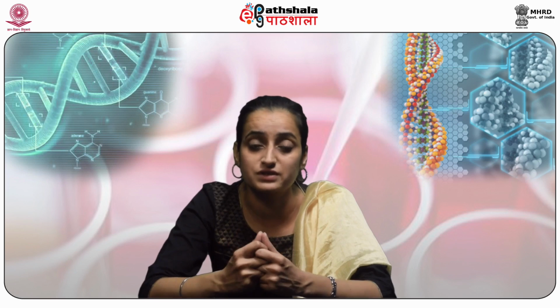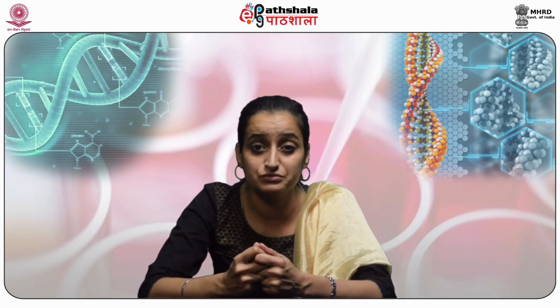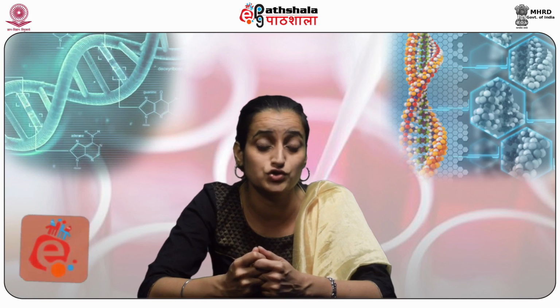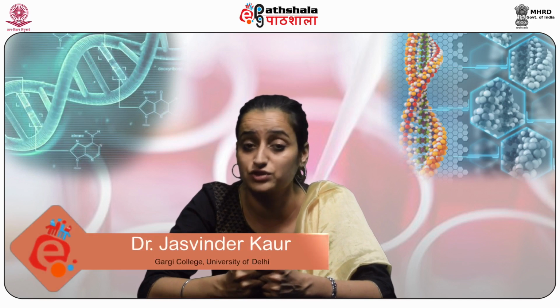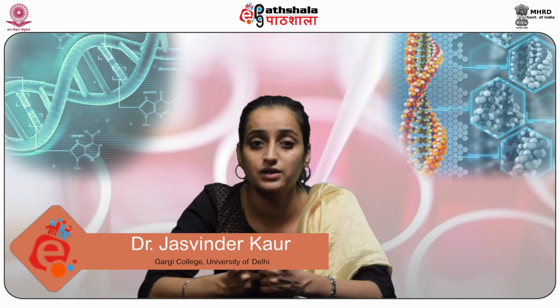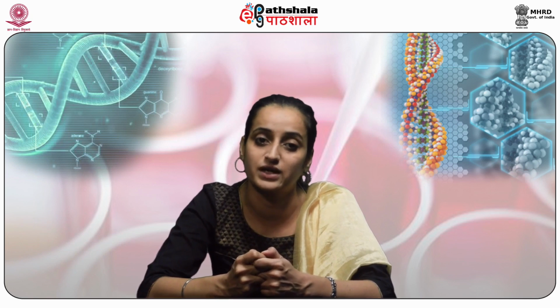Reporter molecules can be radioactive, such as H3, P32, S35, or non-radioactive, such as biotin, digoxigenin or alkaline phosphatase. In-situ hybridization is seen as an expensive, labor-intensive and time-consuming process and also requires knowledge of bacterial expression, cloning and in vitro transcription. Still, it is a very powerful technique and can be used in various fields including developmental biology, pathology, sex determination, chromosome mapping, and microbiology. Thank you.